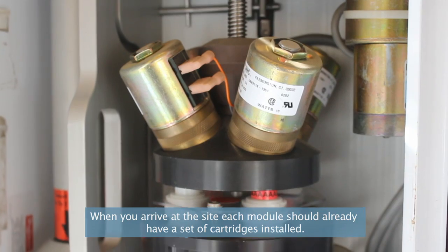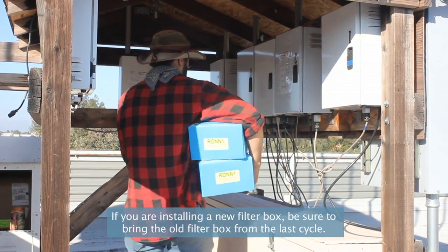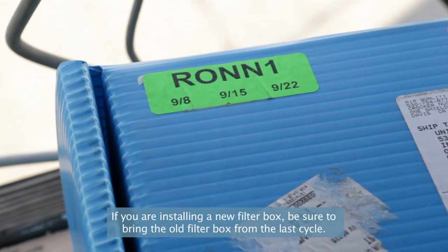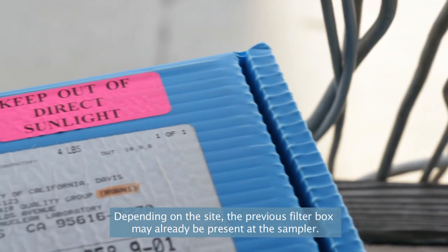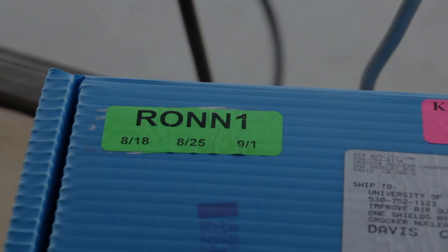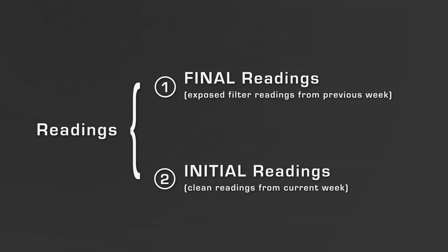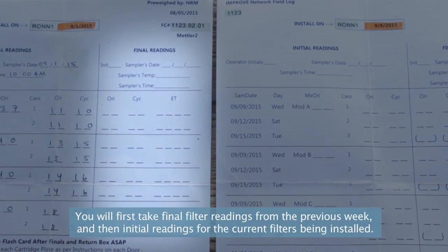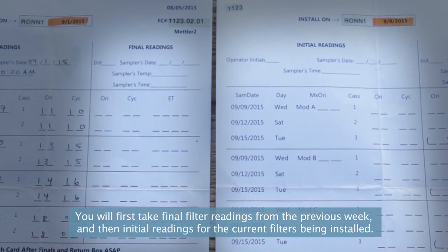When you arrive at the site, each module should already have a set of cartridges installed. If you are installing a new filter box, be sure to bring the old filter box from the last cycle. Depending on the site, the previous filter box may already be present at the sampler. 2 types of readings will be taken during each visit to the site. A common confusion is the fact that final readings are taken first. You will first take final readings from the previous week, and then initial readings for the current filters being installed.